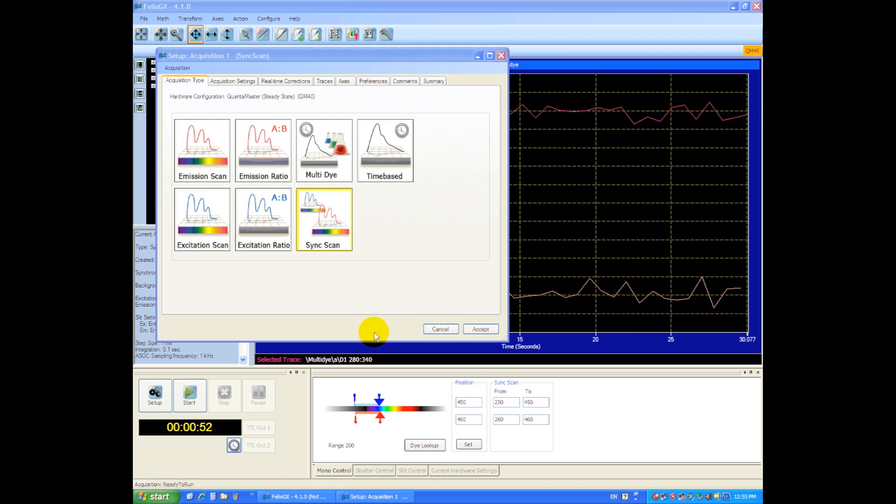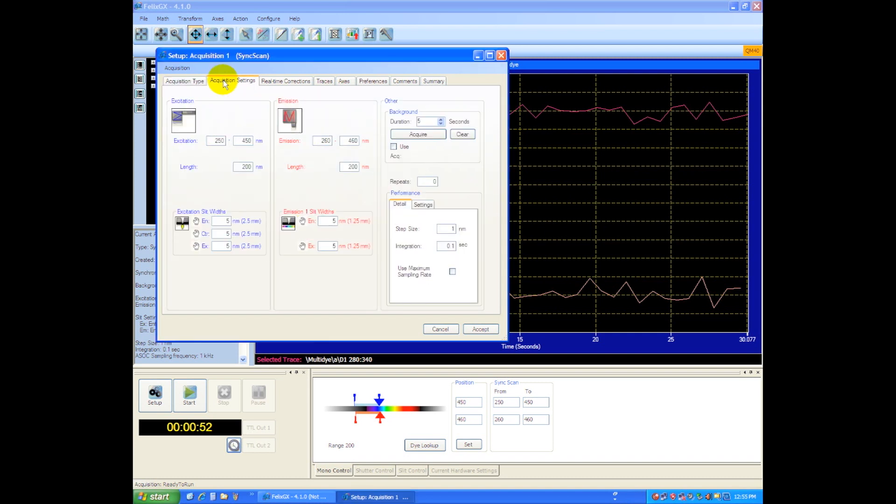So for this experiment we'll choose a synchronous scan and go to our acquisition settings. I know that we need to excite UV for our BSA sample.